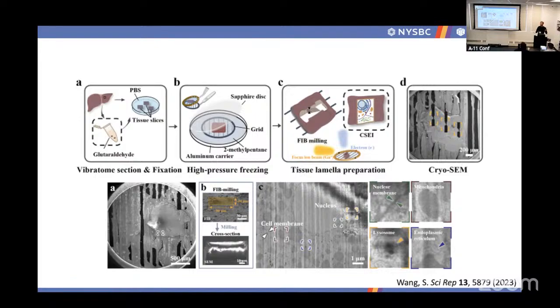So there's a balance between how much time you want to spend optimizing and how much time you want to invest in having a perfectly nice and sharp tomogram at the end. But you can see, nuclear membrane is visible. Mitochondria look like mitochondria, a wiggly tube, like they always do. The tomogram looked fine, the sample looks fine to me.